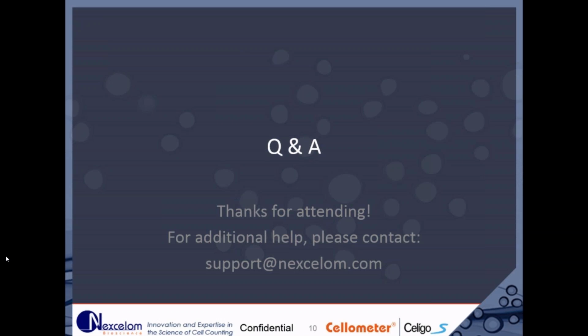Great, thank you, Sarah. Okay, another question. What is the highest resolution and how long does it take to scan a plate at standard and highest resolution? Okay, so our image acquisition is acquiring the plate at 1 micron per pixel. You have the ability to do it at less resolution, which in this case is not of interest for you.